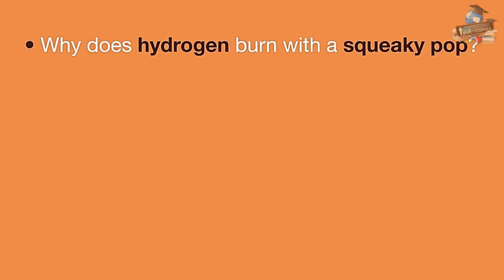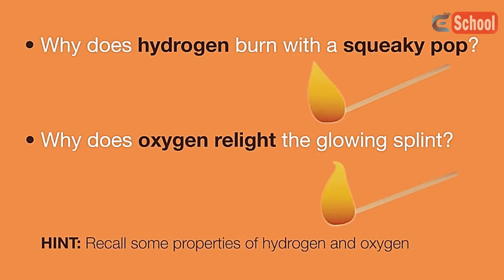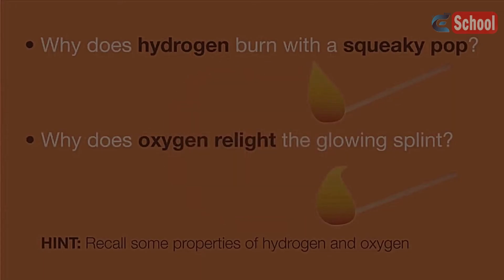Why does hydrogen burn with a squeaky pop? Why does oxygen relight the glowing splint? Hint: recall some properties of hydrogen and oxygen. Please pause the lesson to think about this and resume once you are done.